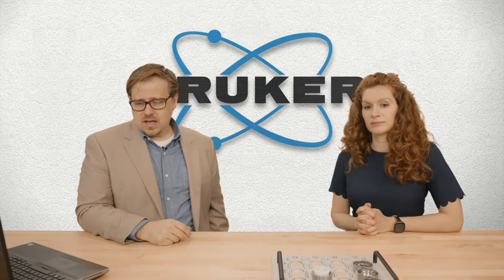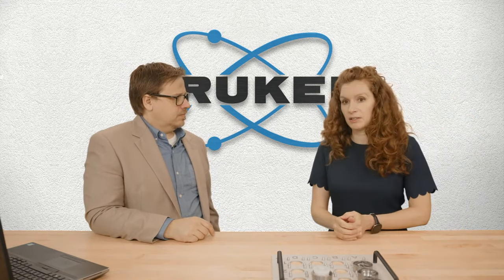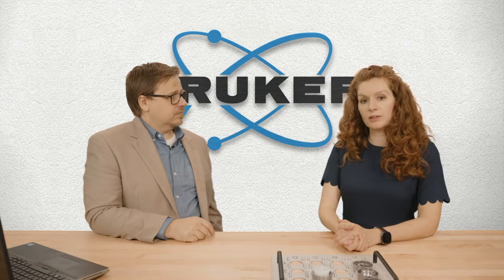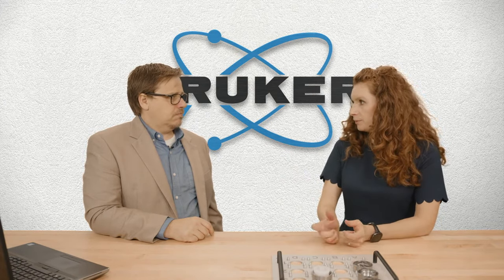So next question from Sven. The question there is, can you analyze sulfur in oil, in particular D2622? Yes. D2622 is one of the standard applications for the S8 because it's an ASTM method that requires a WD system. That's also a good example for maybe using the S6, because the S6 can be customized more. If you put in just one crystal, for example the germanium crystal, you can make it the machine that just does D2622.